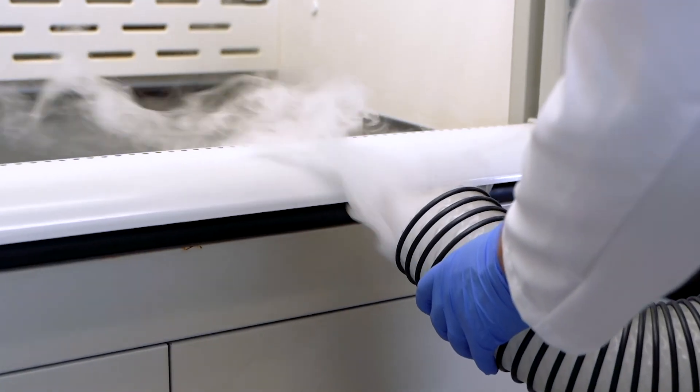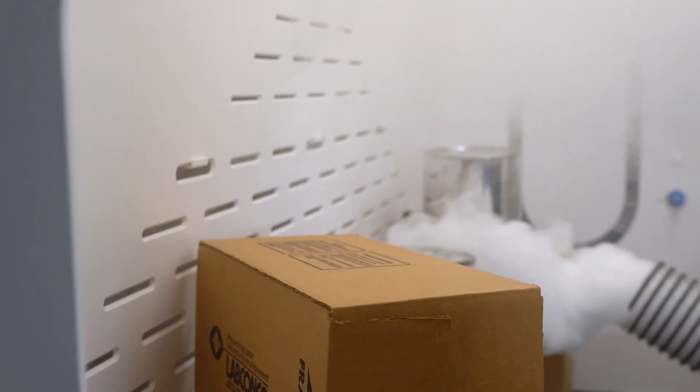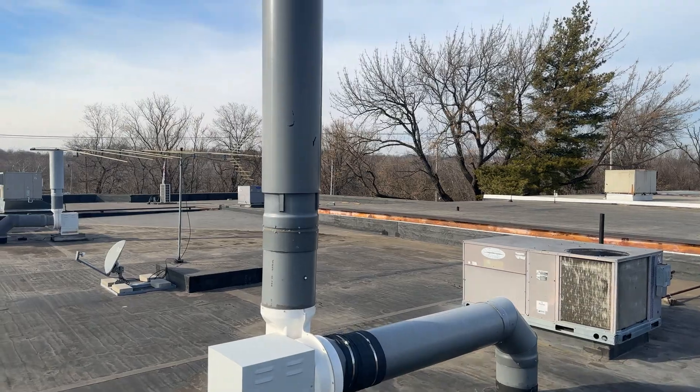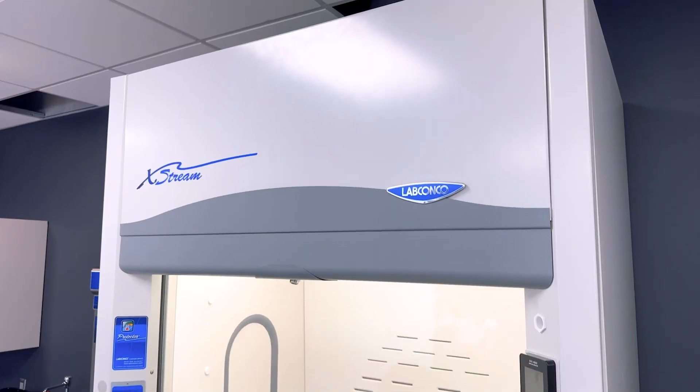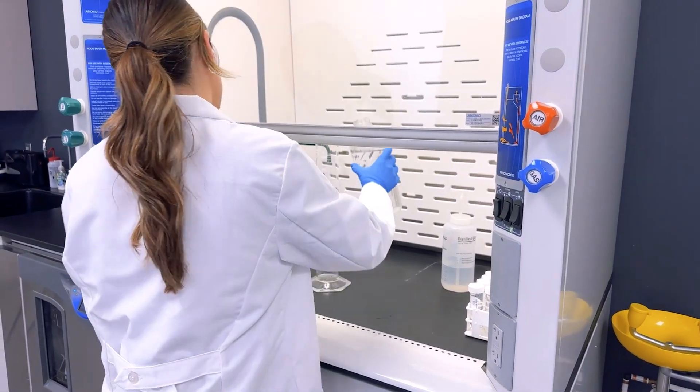As lab air is drawn into the fume hood, it mixes with the hazardous vapors on the interior, which is then drawn back, away from the user, and safely evacuated out the top of the building. Proper use of your fume hood will promote the safety of yourself, your equipment, and those around you.